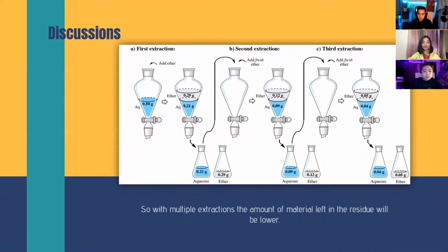Based on the results obtained in the extractions made with hexane, it clearly showed that the use of the multiple extraction technique resulted in a much higher extraction efficiency. However, the same could not be said for diethyl ether extractions, as more caffeine was extracted in the single extraction than in the multiple extraction. A possible explanation is that there was an error in the procedure, such as the tea bags not being squeezed enough, emulsions, or the caffeine molecules being left in the beakers.